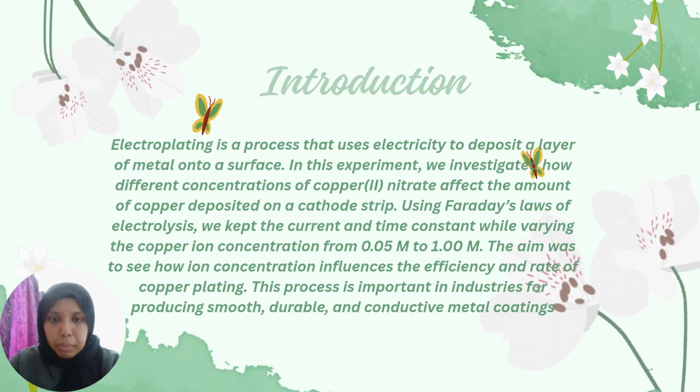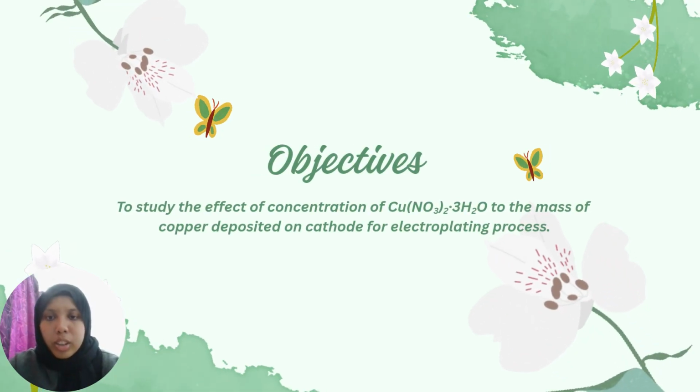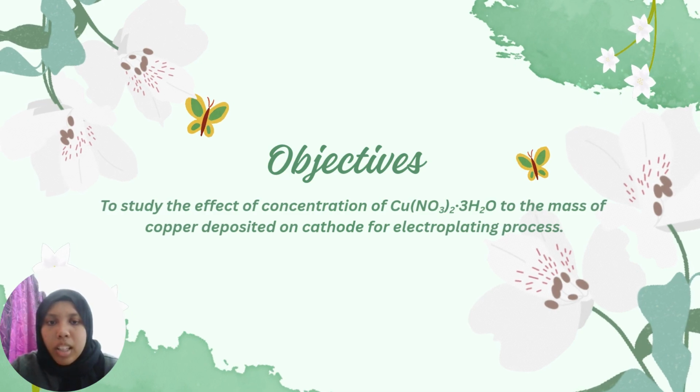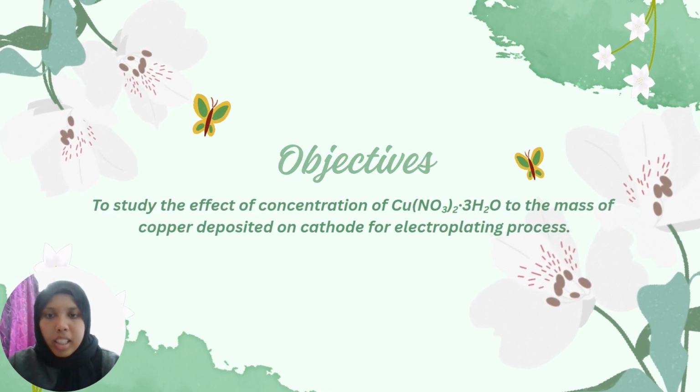The objective of our experiment is to study the effect of concentration of copper nitrate on the mass of copper deposited on the cathode for the electroplating process.